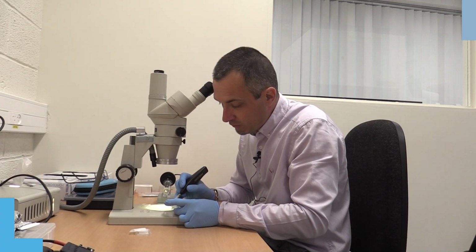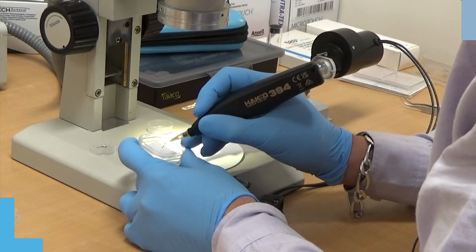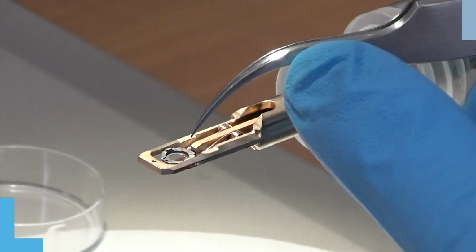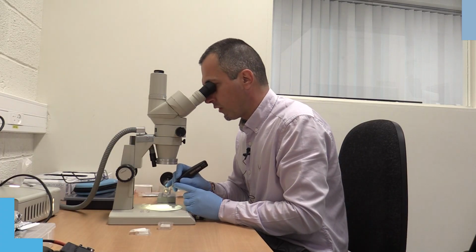As we are using electrons, and we see in transmission, the sample has to be extremely thin, typically below 100 nanometers for the electrons to go through. So we place that very small lamina, which is typically 3 millimeters in diameter, into the sample holder before insertion into the microscope.